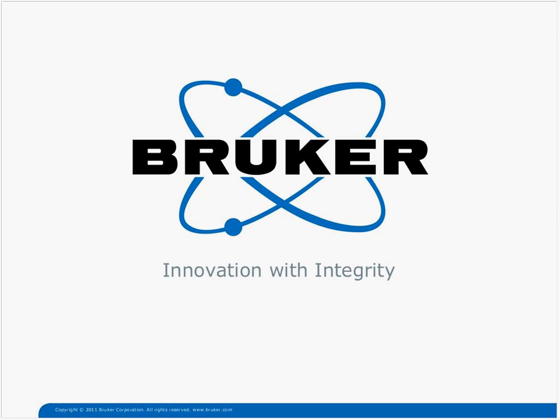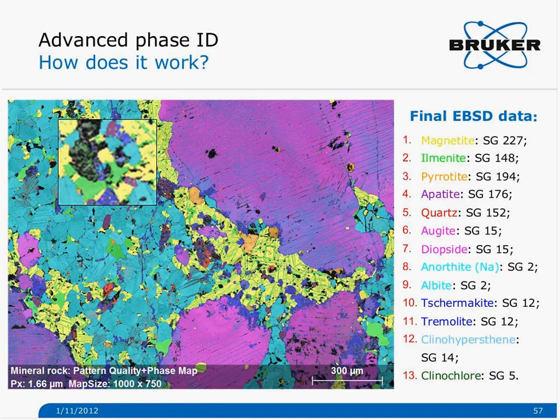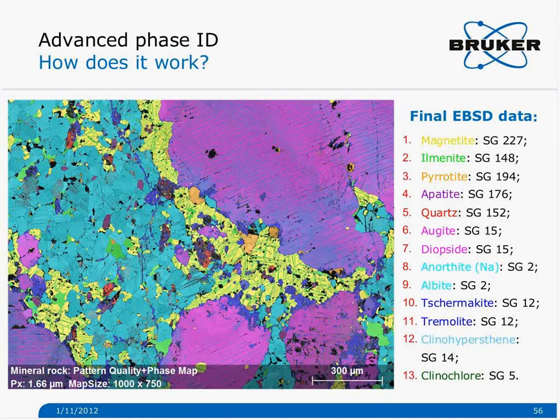And one second, if I may go back to the slide. Next slide. Yes. Here, you see that the quartz is present in just a few grains. Also apatite. Sorry, so this was quartz in red, and apatite, this dark magenta.